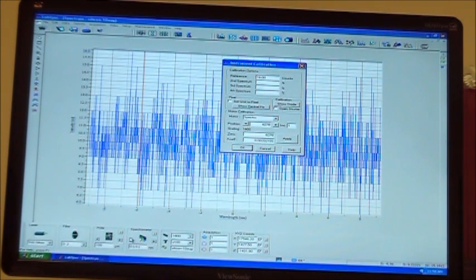And then it says, okay, I'm at 0, and goes to a mechanical switch. When you type 0, the instrument just counts backwards the motor steps and goes, I'm close enough to 0. And you might be at like 0.2 or minus 0.3, but the instrument goes, that's 0. You can see it in the middle. That's good. So for calibration, always click on the left arrow to bring to 0.